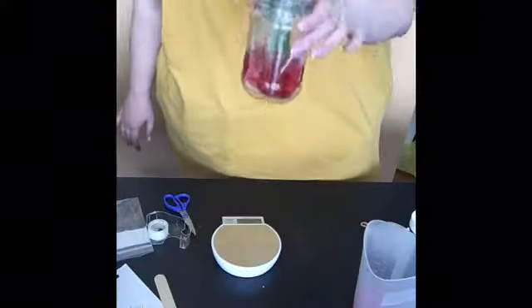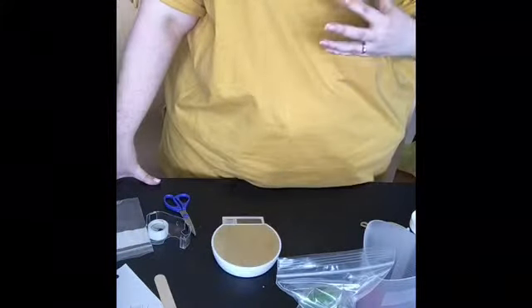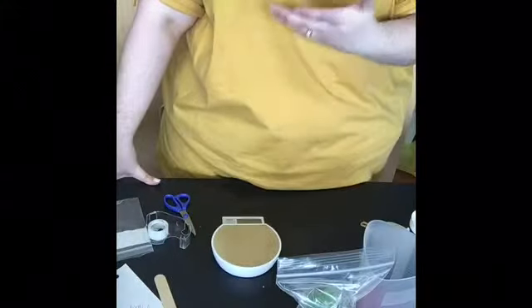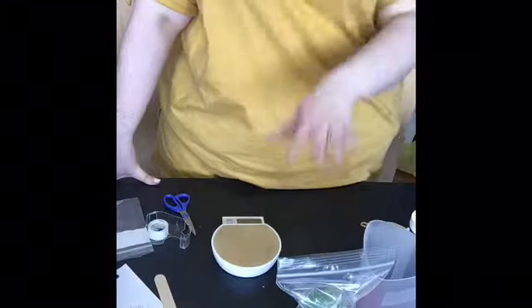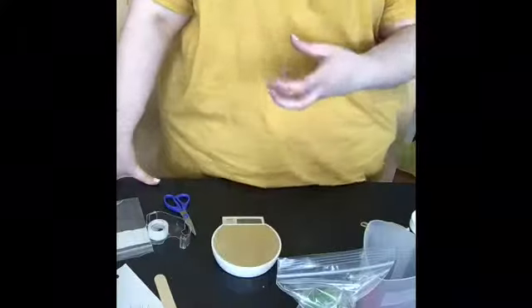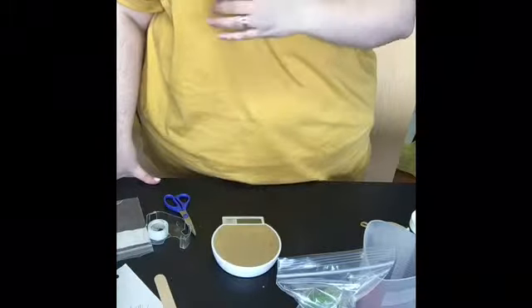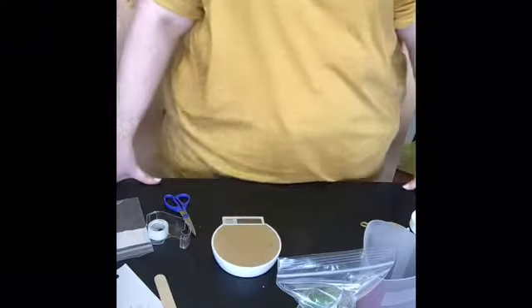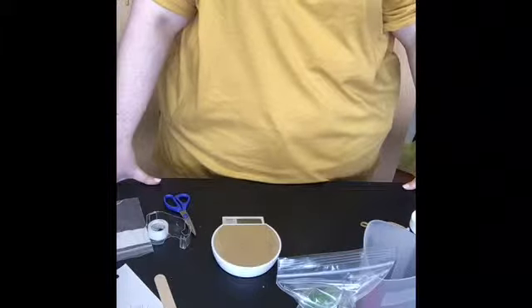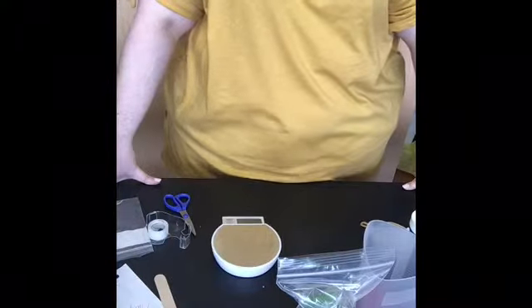My other container is going to go on my windowsill to be nice and warm with the sun and heater on it. After 24 hours I'll take both containers out, measure them again, and compare how much water transpired to see whether temperature makes a difference. Do we get more water transpiring in a warm area or less? What about the cold area? Make sure you have everything written down for your lab report, collect your data accurately, and get 100 milliliters of water in both containers. Have fun!